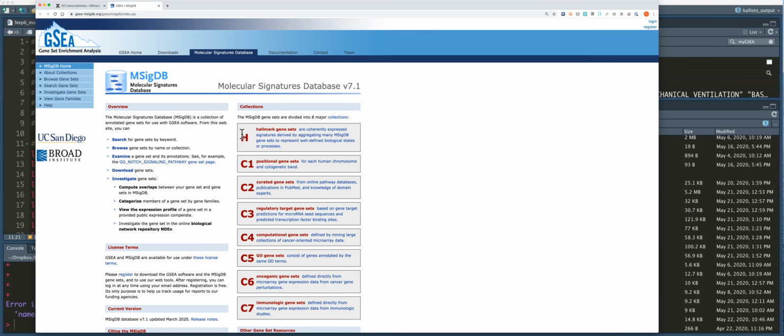So in our case, this would be genes turned up with disease, the highest gene at the top. Descending from there, the genes around the middle of your list would be genes that really aren't changed between your 2 phenotype classes, and then all the way down to the opposite, which is genes that are really turned down with disease. Once you have this ranking, the data is no longer necessary. Now we've rank ordered the genes, and that's what's used for the GSEA analysis.